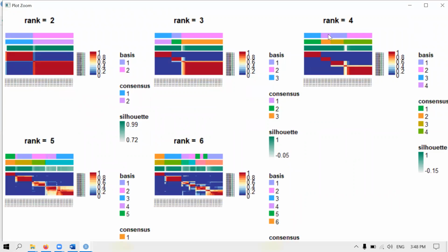Okay, one more. So this is how we read it. This tells us 2 groups. Things are actually well separated for 2 groups. For 3 groups, there may be some errors, but it looks okay. So you want to see when the diagram actually starts to disperse.